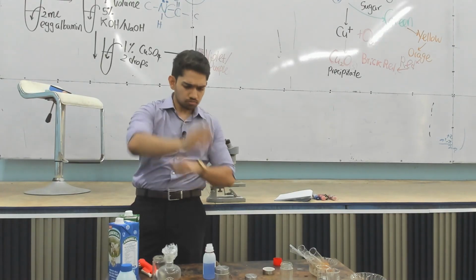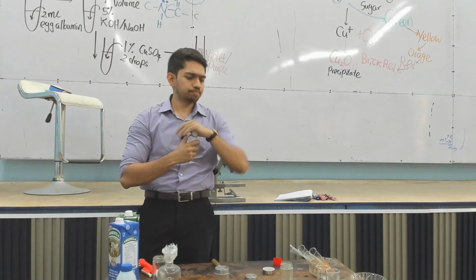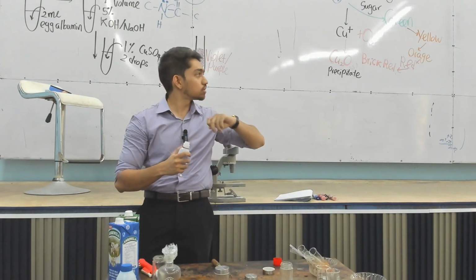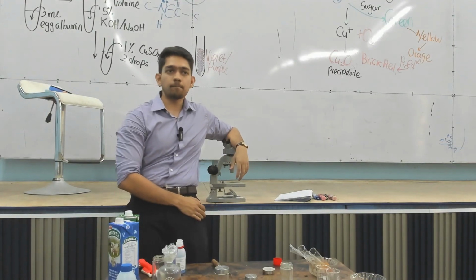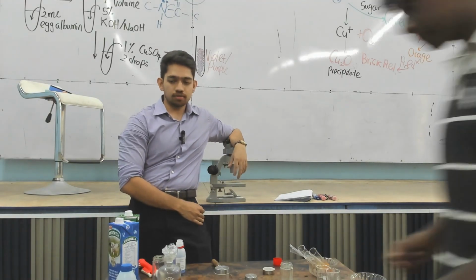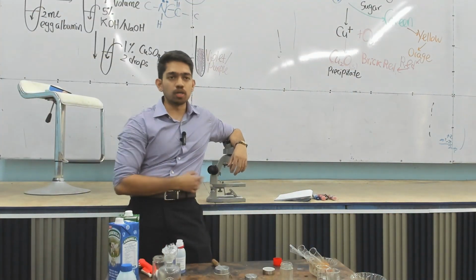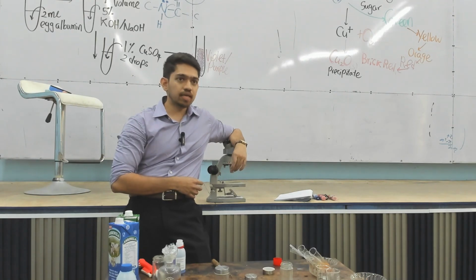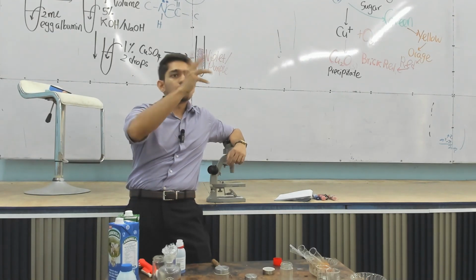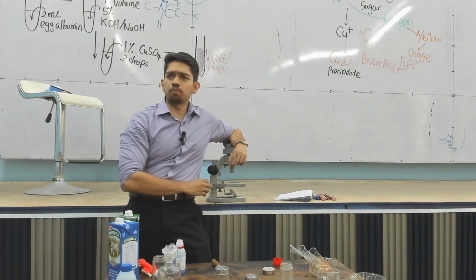So, clear about our biuret test? Yeah. So, we used two things. One of the tests was egg white and the other sort of milk protein. Milk protein, what do you have in milk protein? Online people, yeah? Casein. Casein, no? Right?